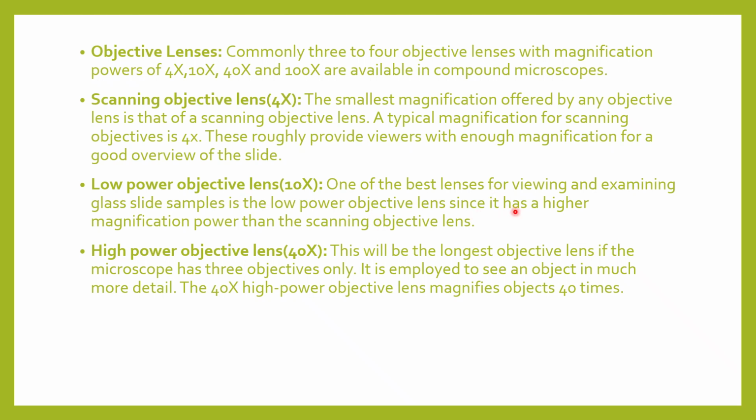It is one of the best lenses for viewing and examining glass slide samples, since the low power objective lens has a higher magnification power than the scanning objective lens. Yes, so this is the best magnification power for viewing and examining the glass slide.